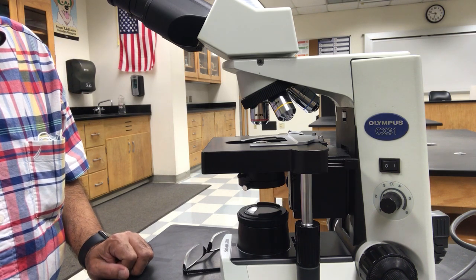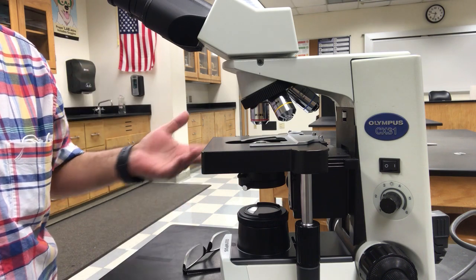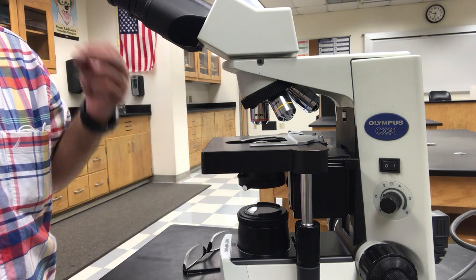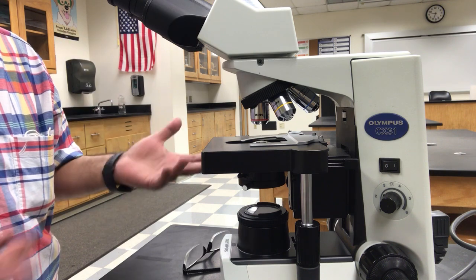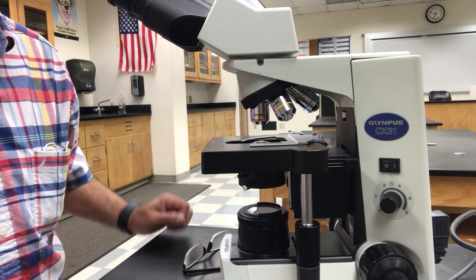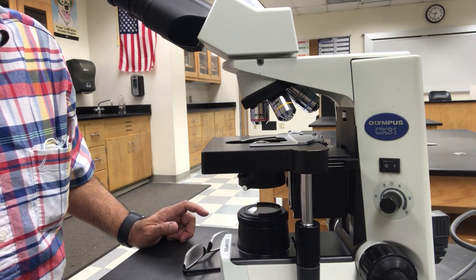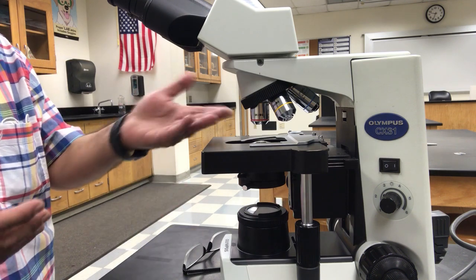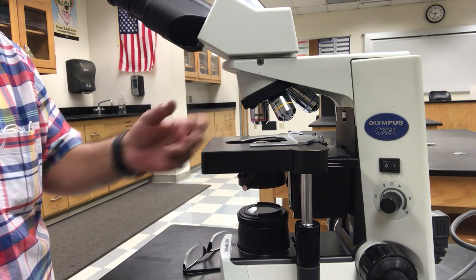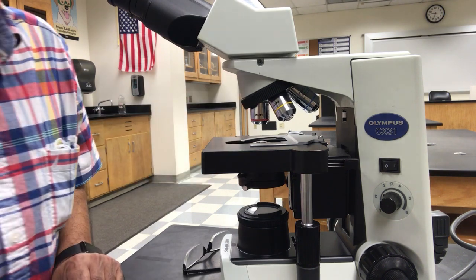Throughout the lab manual, you will see a lot of these pictures of the slides that show you all these very small structures magnified, and you may see as a footnote under the picture, it says under 40x magnification, so you know which power was used to show the object. That's it. Hope it helps.